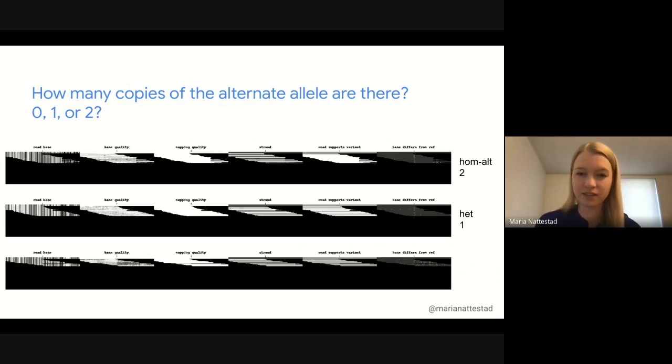For this pileup image, I see less than half the reads supporting the variant. The coverage is lower, there are fewer reads shown here. We have some issues in the last channel with more white dots showing read errors, and in the base quality channel you see a lot more black, so we have lower base qualities. There's one read showing bad mapping quality. But the base qualities, the fewer number of reads supporting, and the many differences tell me this is probably a classic case of a zero, homozygous reference.